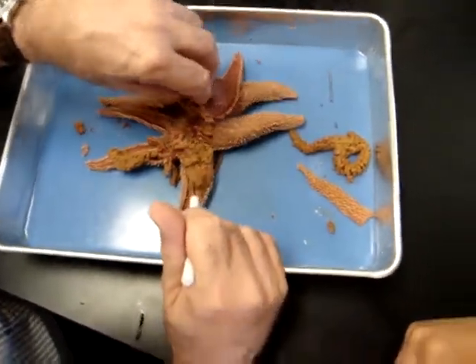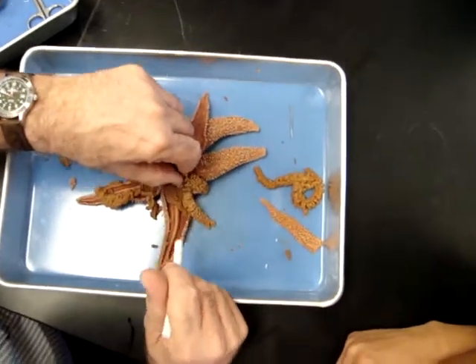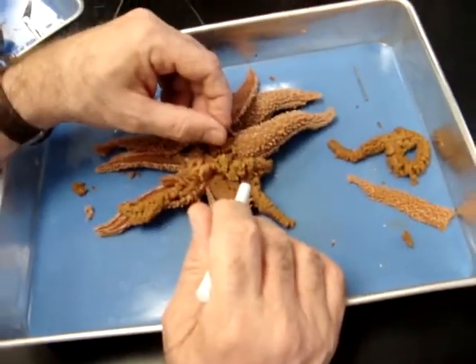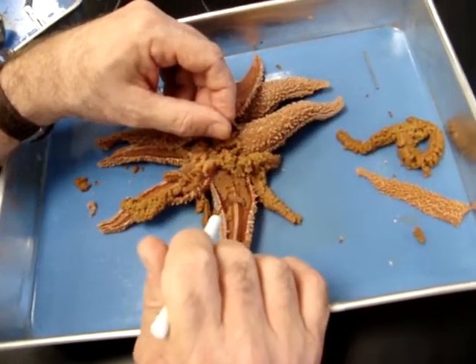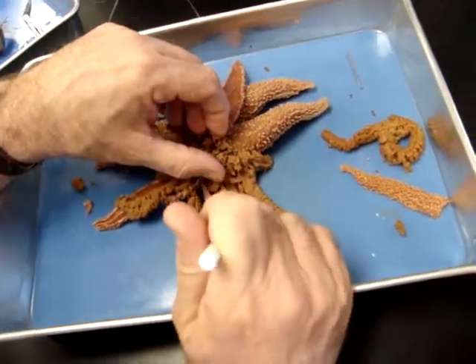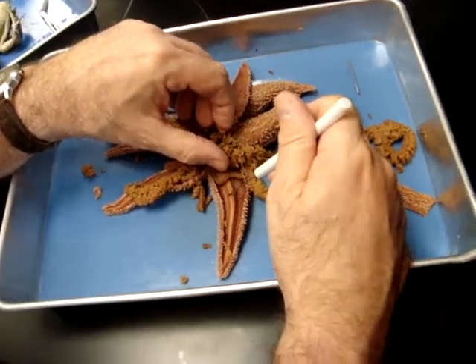You have to admit, it's kind of wild that it can all fit into a given structure, right, like that. How compact is that? That's gonad right there. Pyloric cecum, and notice this appears to be segmented, and this is egg-like. This is gonad. Are we all right with that? Now, do you see these things that look like bubbles right here? If you can't see them, get to them.